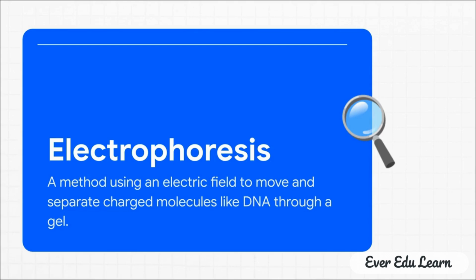You put your mix of molecules, like different sized pieces of DNA, into a slab of gel. Now, you can think of this gel as a thick, tangled forest. Then you apply an electric current. Since DNA is negatively charged, it starts moving toward the positive charge at the other end. But here's the clever part. The tiny, small pieces of DNA can wiggle through that forest really fast. The big, bulky pieces, they get caught up and move much slower. When it's all done, you have a perfect lineup. All the molecules sorted by size, like runners finishing a race.